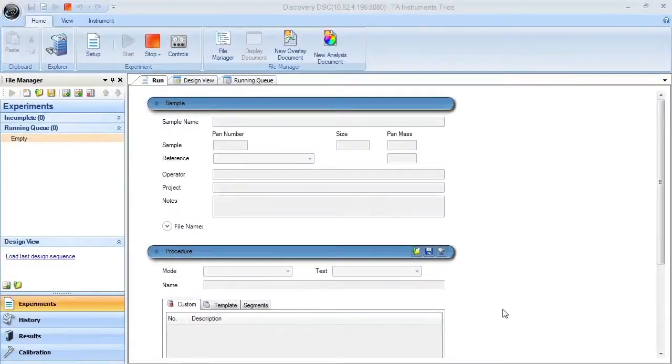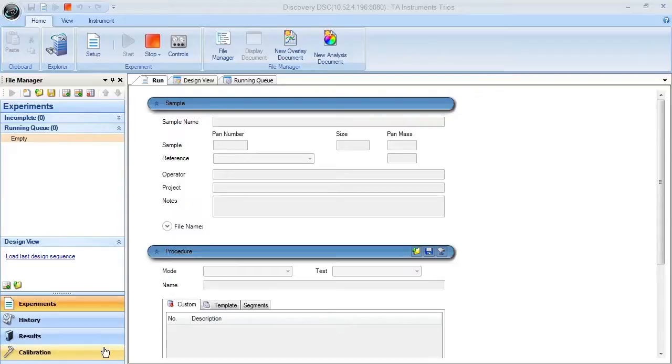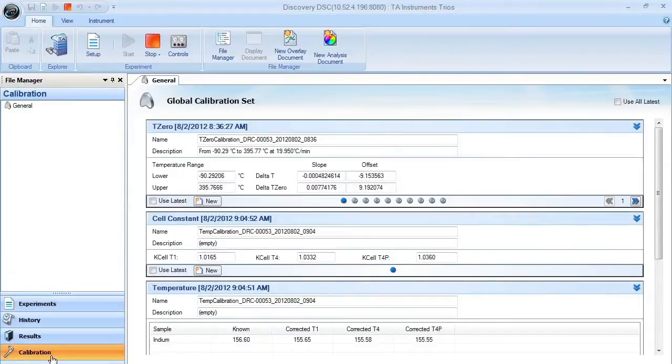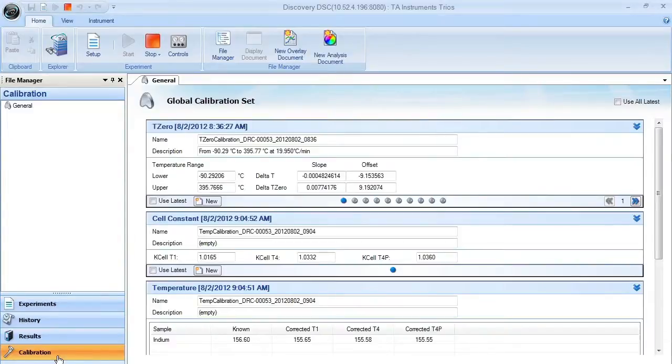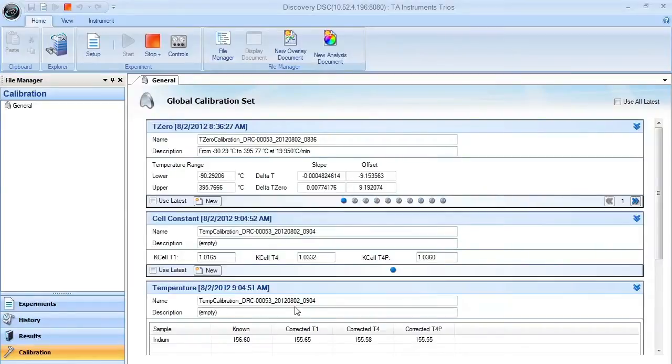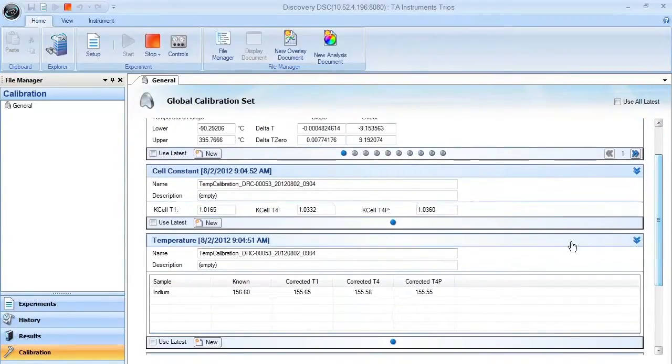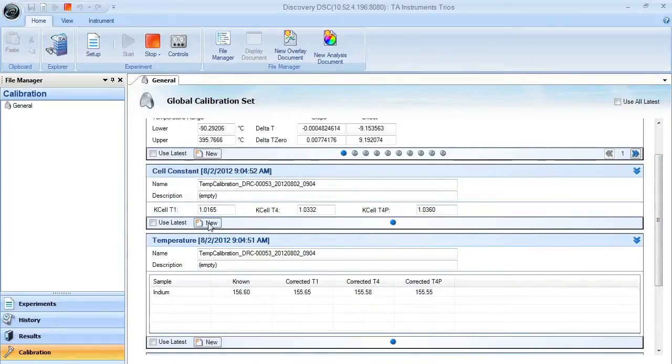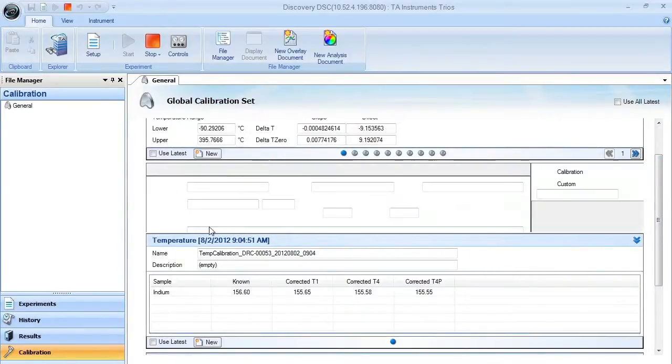To set up and analyze the calibration data for Discovery DSC, if you're going to do temperature and cell constant, you need to make sure that you click on the calibration button. When you do that, you get to the global calibration window. If you're going to choose temperature or cell constant, in this case we'll choose cell constant, you need to make sure that you select new to collect new data.